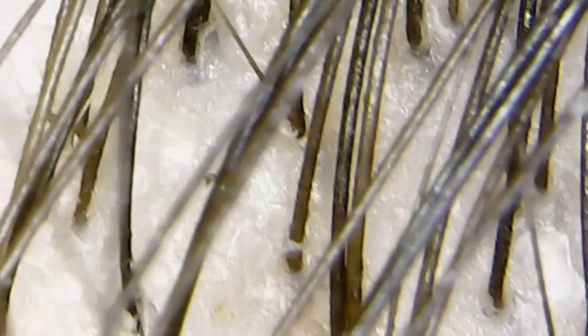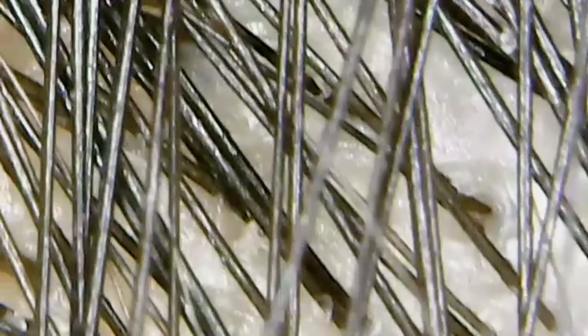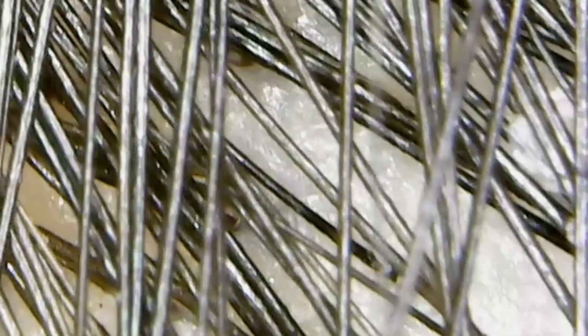Unfortunately I was not able to find any lice. I'm a teacher in school and currently we have head lice, so I told my colleagues to give me a sample if they find any head lice in some of the students. I'd like to put it under the microscope, but you can see no insects here.